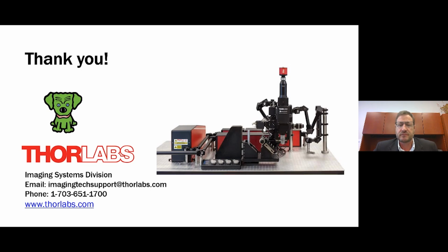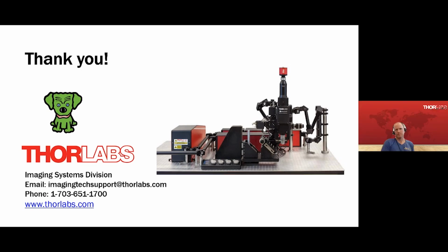And then another one for Brian. How does the laser not burn the SLM when you're doing 2-photon on an SLM for the Bessel beam? Isn't there a lot of power in the 2-photon laser? And what is the power handling of the SLM? I do not know the power handling of the SLM, although it has not been a problem for us at this point.